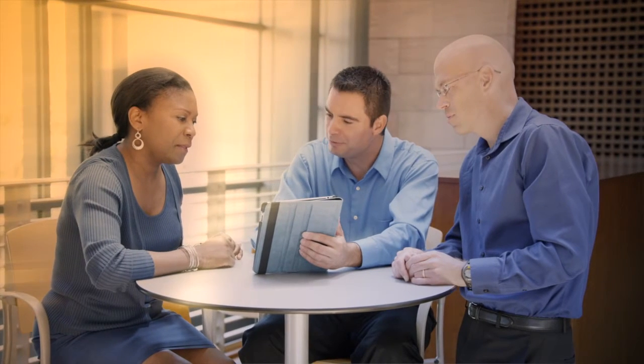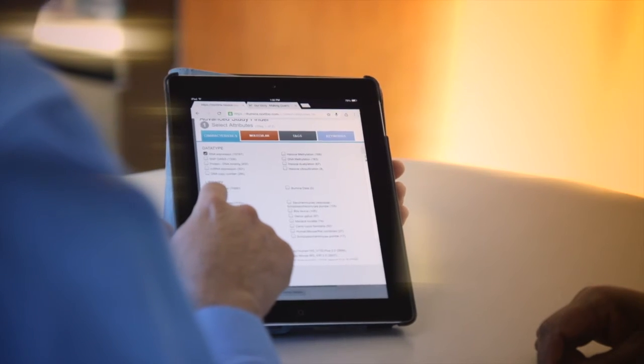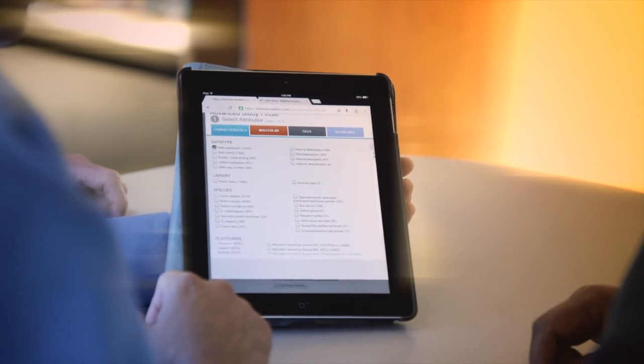Investigate various gene types from different model organisms with the Body Atlas, Pharmaco Atlas, and Knockdown Atlas apps.